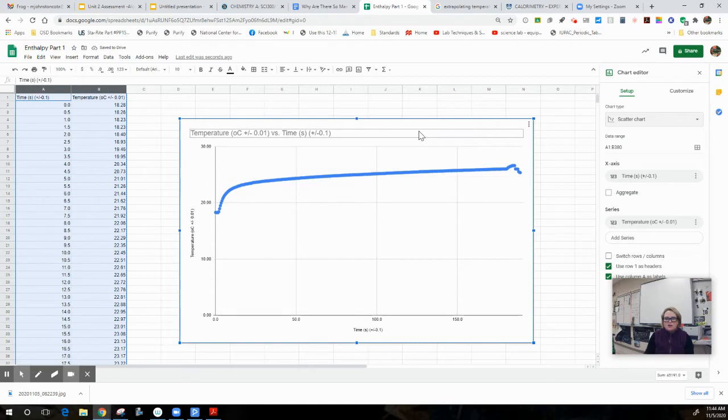The data is not great, however, but this is raw data. This is the data that I collected during the investigation. So this is what we're going to use, because this is what you would do if you were here as well, using data that you don't even like. So if I notice right here, right about this point, is time 0, even though it's not on the y-axis. And that's because that's the lowest minimum temperature right there.